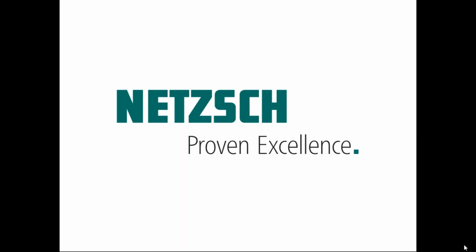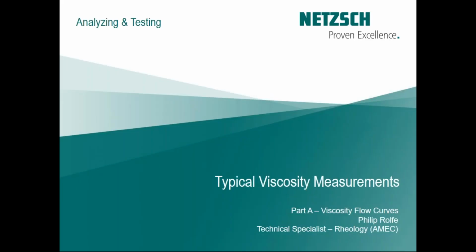So this is module 3, and so we're going to speak about viscosity flow curves, part A and then part B. So how would you make a viscometry test actually on the instrument?